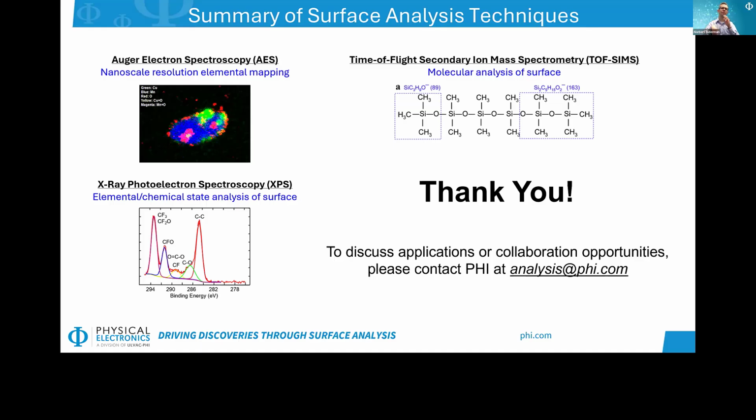For example, it can tell you the difference between metal to metal bonds versus metal to oxygen bonds in the form of a metal oxide. Thank you so much for listening to today's presentation.